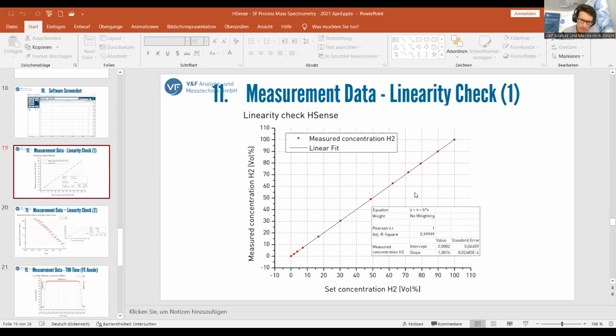ISO 14687 specifies contaminants to be measured in hydrogen, not the hydrogen itself. That is a different instrument, and not really the topic of this meeting today. Maybe we can organize something similar for this other type of instrument.